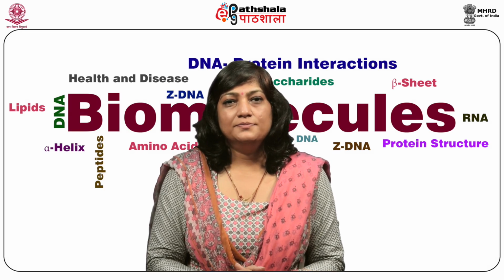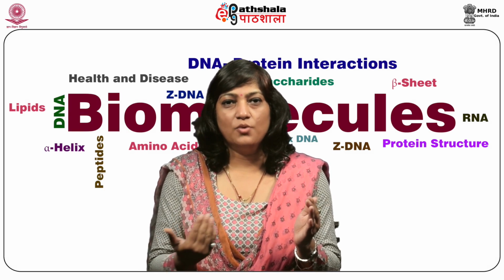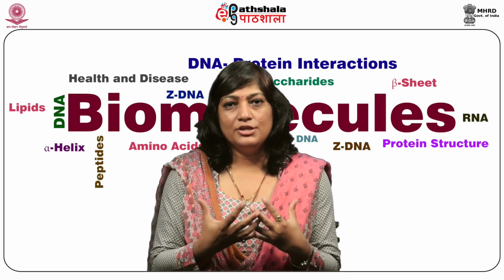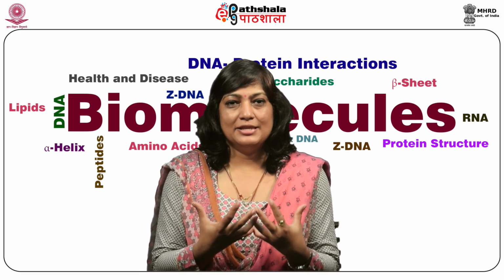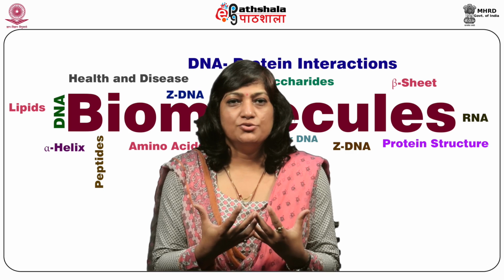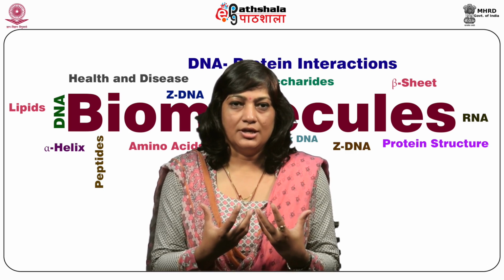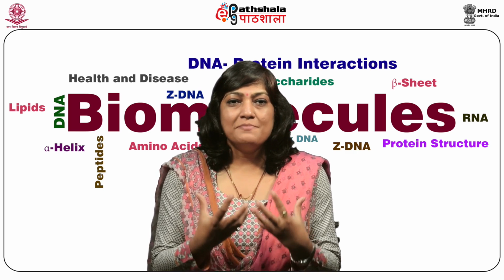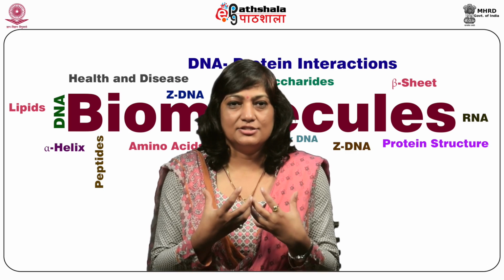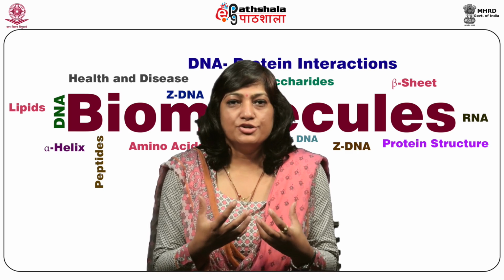So there are three different steps that are normally followed when you are working with lipids. The first step, when you need to analyze lipid from a given cell or a tissue of an organism, is to extract the lipids from the cell or the tissue. So what are you aiming at when you're extracting these lipids? You're actually aiming at a solution that would be enriched in lipids. And how do you do that?